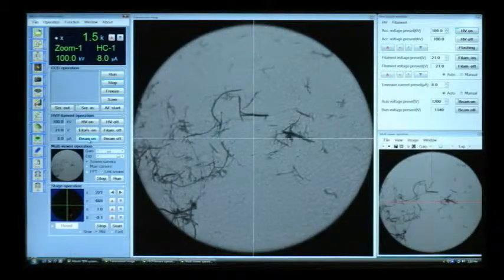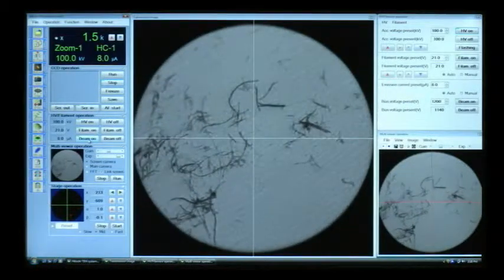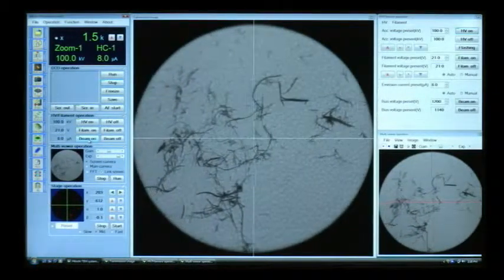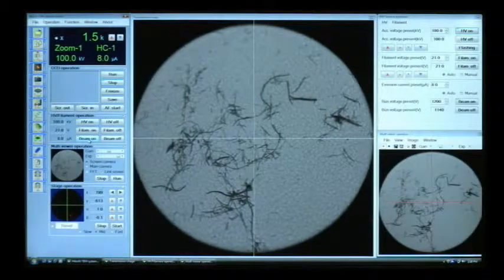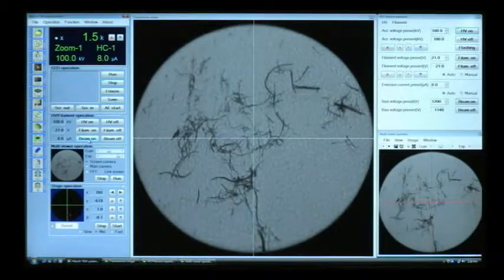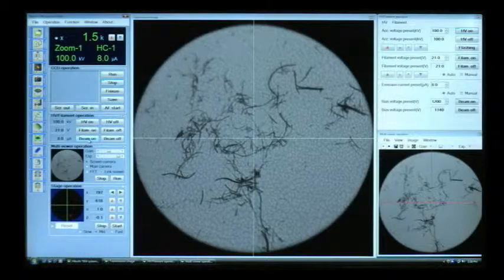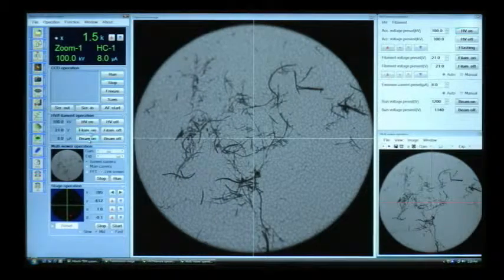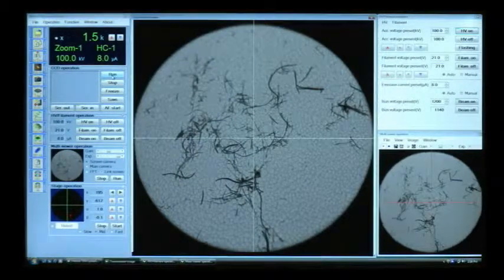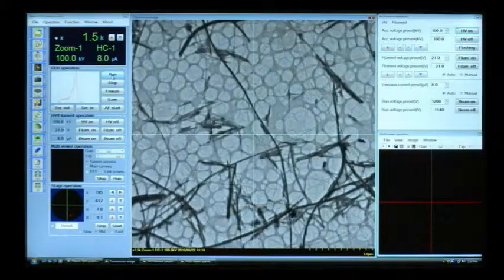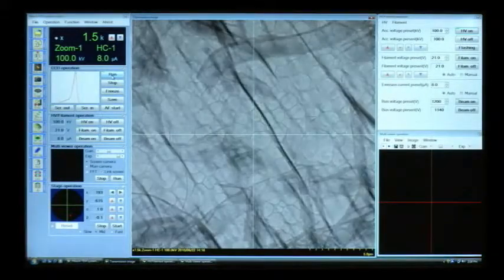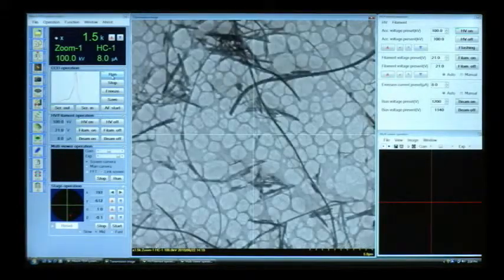Images that have traditionally been difficult to distinguish in a typical TEM specimen search because they were too dark on the fluorescent screen can easily be observed on the HT7700 LCD monitor. In addition, with the integration of a high pixel density CCD camera, final high-resolution digital images can be recorded easily.